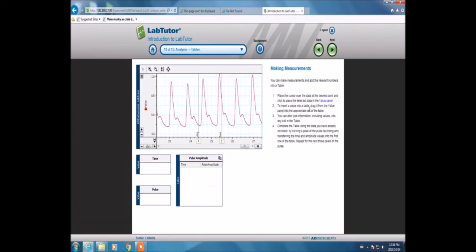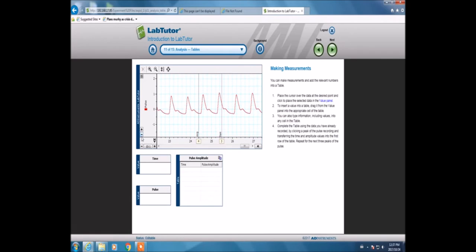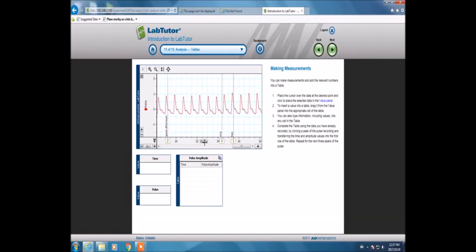Now we're going to use data analysis. Basically, we're going to collect the peaks—the readings from the peaks—and add them into the graph in order to perform calculations.